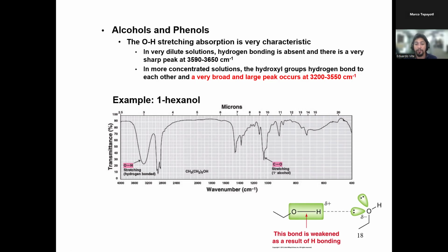Sometimes we take an IR spectra just to confirm a single functional group. Remember, you can't look at a spectra and tell me the identity of the entire molecule. You need way more information for that. The IR is just one part of the whole. So just keep that in mind.